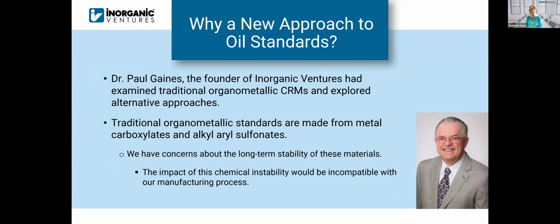Now, why did we decide to look into a new approach to testing metals in oils? This idea came from Dr. Paul Gaines, who is the founder of Inorganic Ventures. Many decades ago, Paul spent a lot of time while he was with Exxon Research studying and working with organometallic standards and wear metals in oils testing.